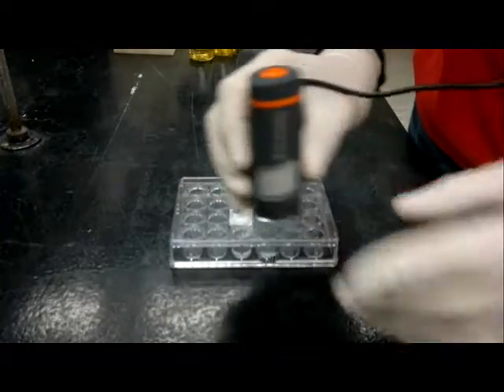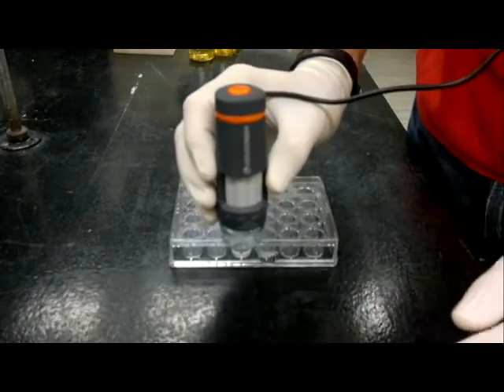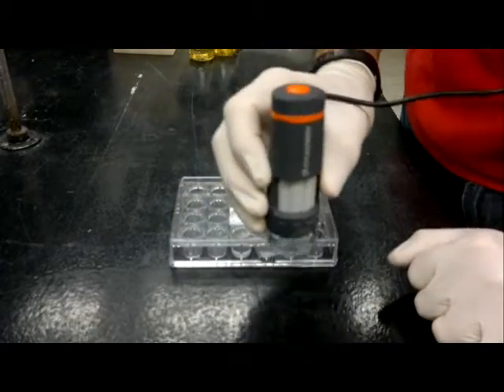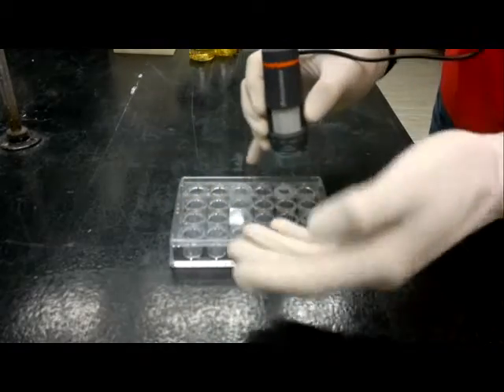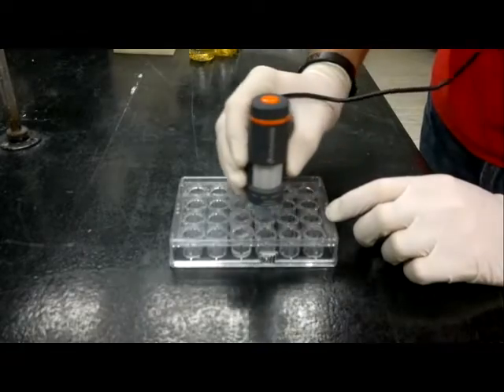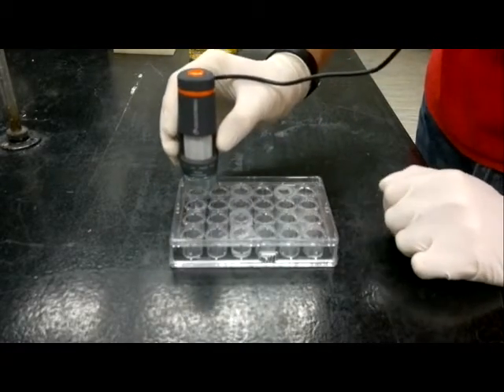At this point, it's maybe not necessary to actually take pictures of the various crystals because they're at fairly low magnification and you have not yet verified whether they are actually protein crystals. But you can certainly survey along, and this way you don't even have to take the lid off. It's very safe for your crystals. Which wells contain potential protein crystals?